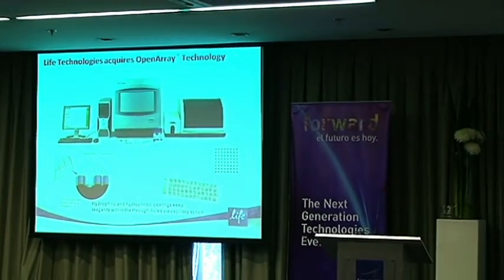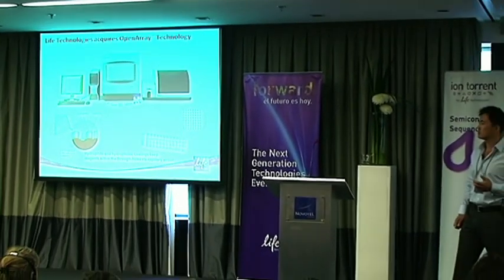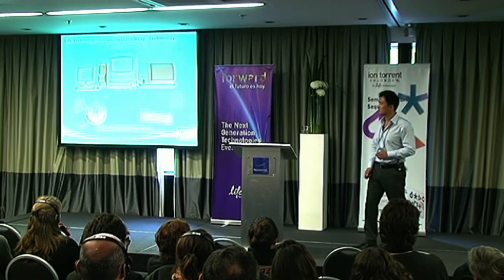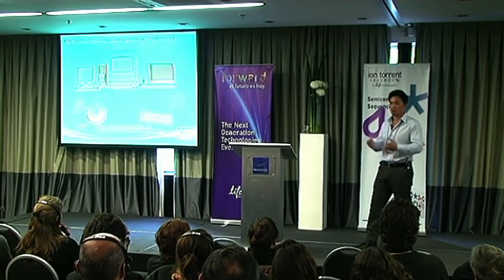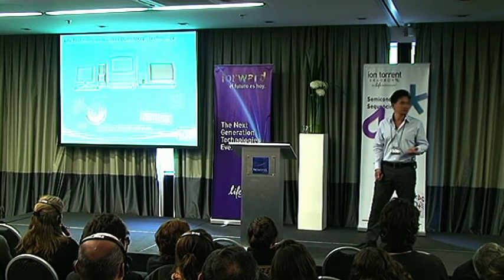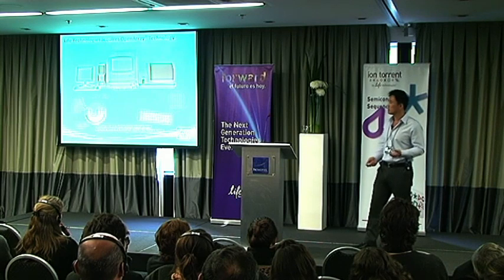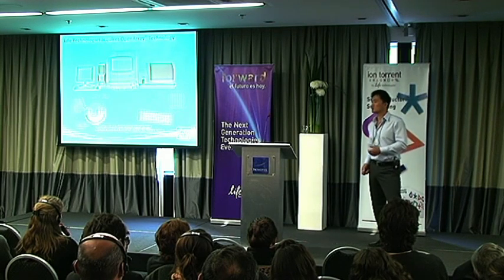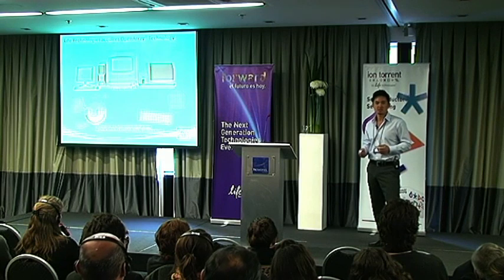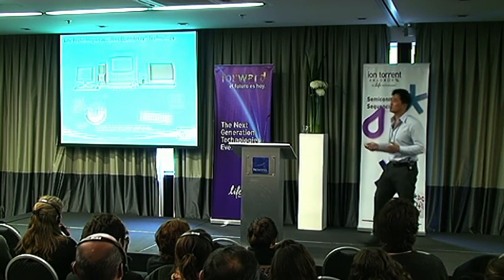So that's another advantage, because imagine if you're working with hundreds of plates, a multi-month project. Maybe you have multiple labs cooperating together on a project, and now you're asking someone to go into the freezer and pull out of the freezer like 50 tubes, 100 tubes, 200 tubes, and you're trusting that researcher that when they're pipetting manually over and over and over again, that they're actually doing this without switching the assays. So think about the possibility of human error.